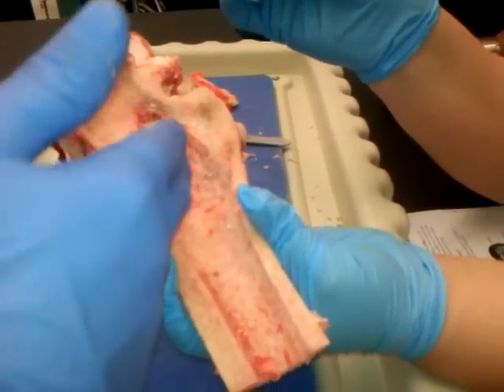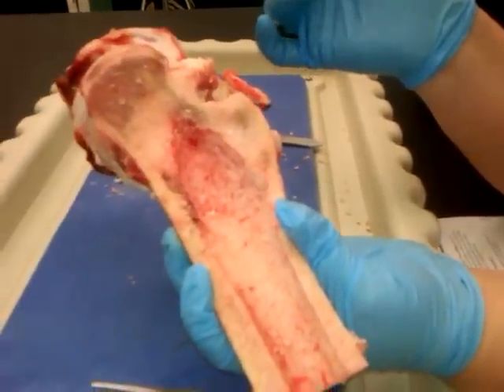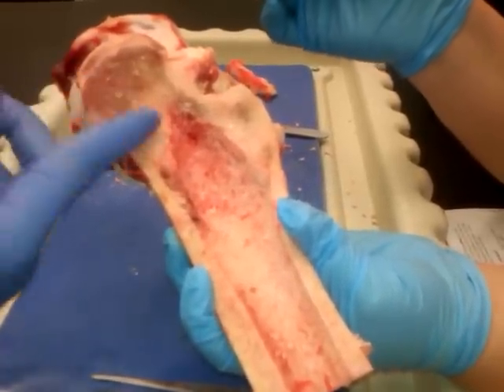These little spiky things here — that's the trabeculae. You can feel them; some of them are more pronounced. They're even sharp — they'll go right through your glove. What do you call it? Trabeculae? Yeah, the trabeculae of the spongy bone.